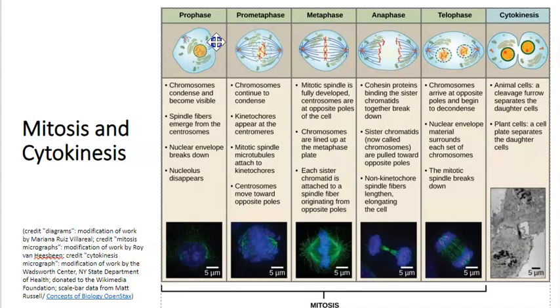During prophase, we also have these little tiny structures that you're seeing here in blue. These are centrosomes. Centrosomes are present in both interphase and mitosis. In prophase, they begin to migrate to opposite poles of the cell. That's important because these centrosomes act as little organizing centers that help to position the mitotic spindle, those proteins that are very important in stretching the cell and moving the chromosomes.